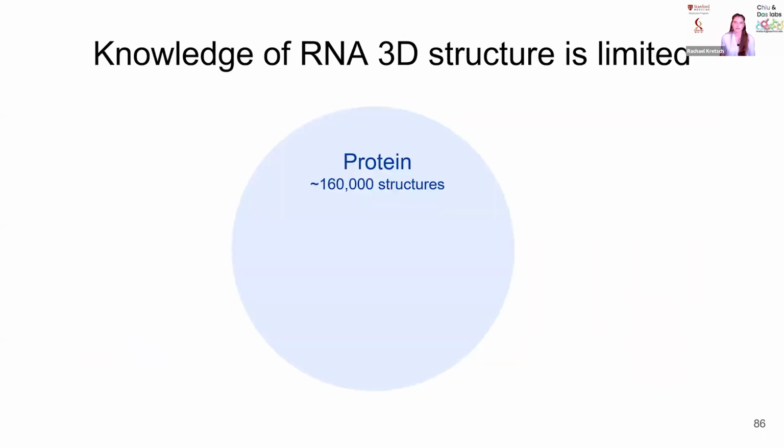And why is this so revolutionary? Well, I think it becomes obvious when we look at the past of structural biology. So structural biology has managed to solve 160,000 protein structures, right? Huge amount of protein structures. How good are we with RNA? Well, we're around 100 times less structures solved for RNA, right? And this is due to many challenges with traditional techniques. But it is our hope that Cryo-EM can help us solve these RNA structures, unlike other past techniques.